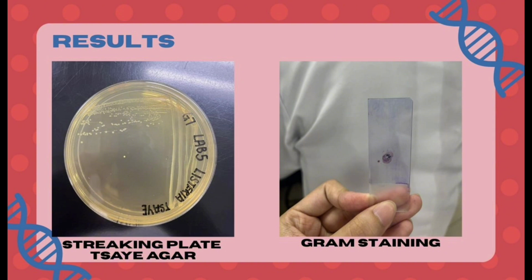On the right, you can see the glass microscope slide prepared during period 5. This slide contains our heat-fixed and processed bacterial smear using the standard gram staining reagents. The crystal violet iodine complex is neatly localized in the center of the slide, indicating an appropriate concentration of cellular material ready for high-power oil immersion microscopy.